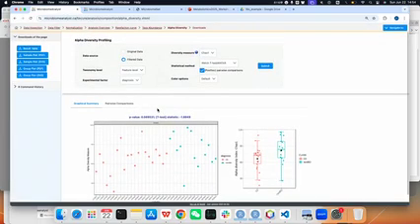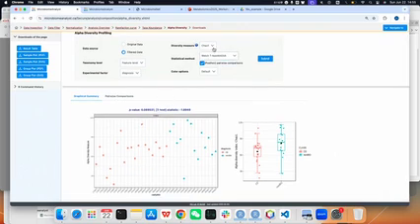The first one is the common alpha diversity. We provide different methods to show the observed richness or the evenness of the species. So here we use first this one, which should be close to the observed. It considers the category, and we can see there seems to be a difference between the CD group and the control group. The control group seems to have more diversity.